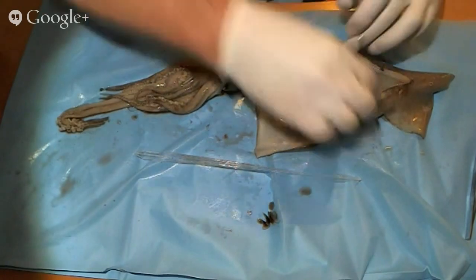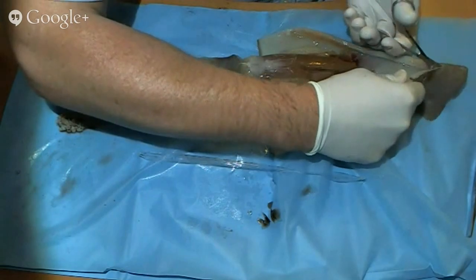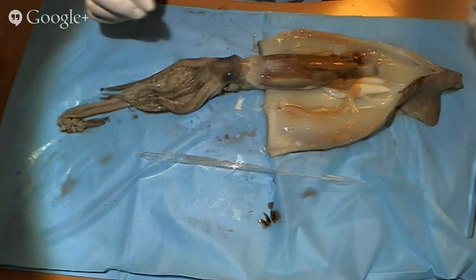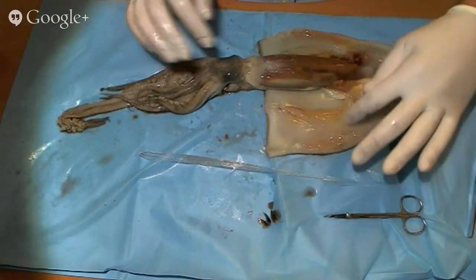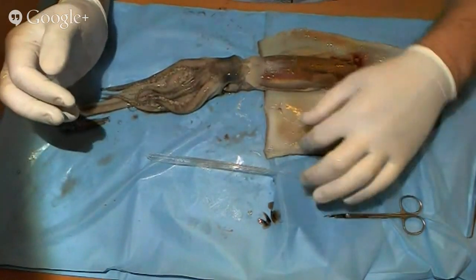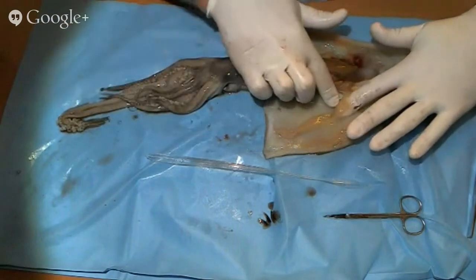So you can see inside here, and because the main focus of this is to show how a squid is like any other living thing, that it eats, breathes, moves, grows, and reproduces, then I'm not going to spend a whole lot of time on the total internal organ system of the squid, but I do want to try and show off these big beauties right here. Because one of the things we talked about is that all living things eat, breathe, grow, reproduce, and move. And in this case, this is the way it breathes.